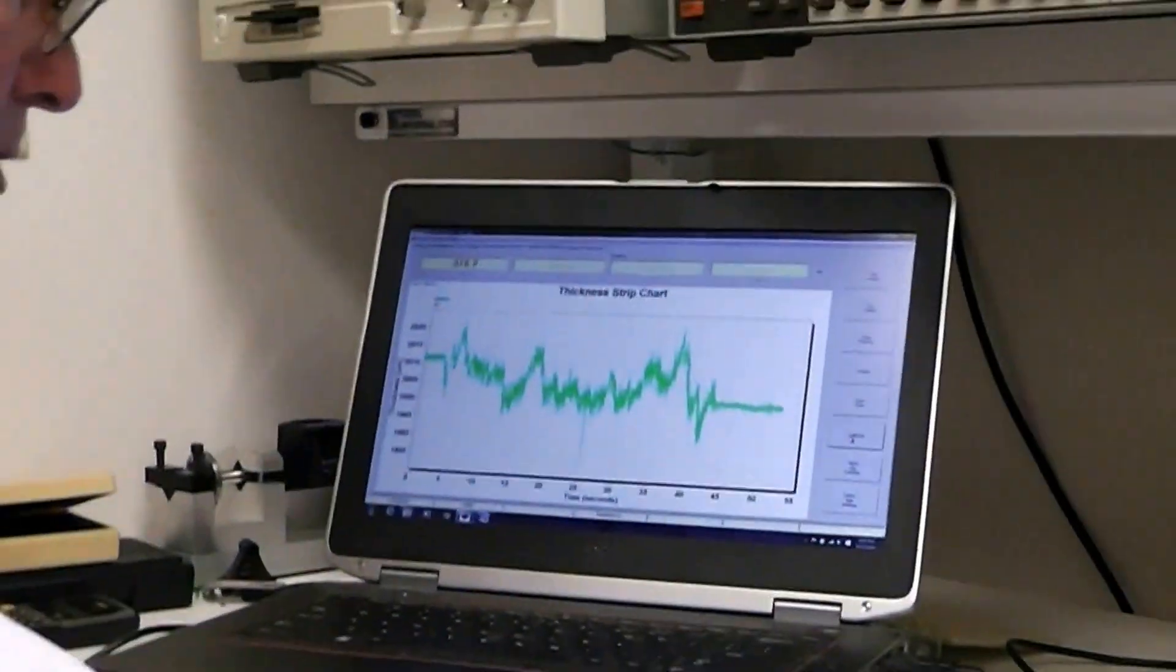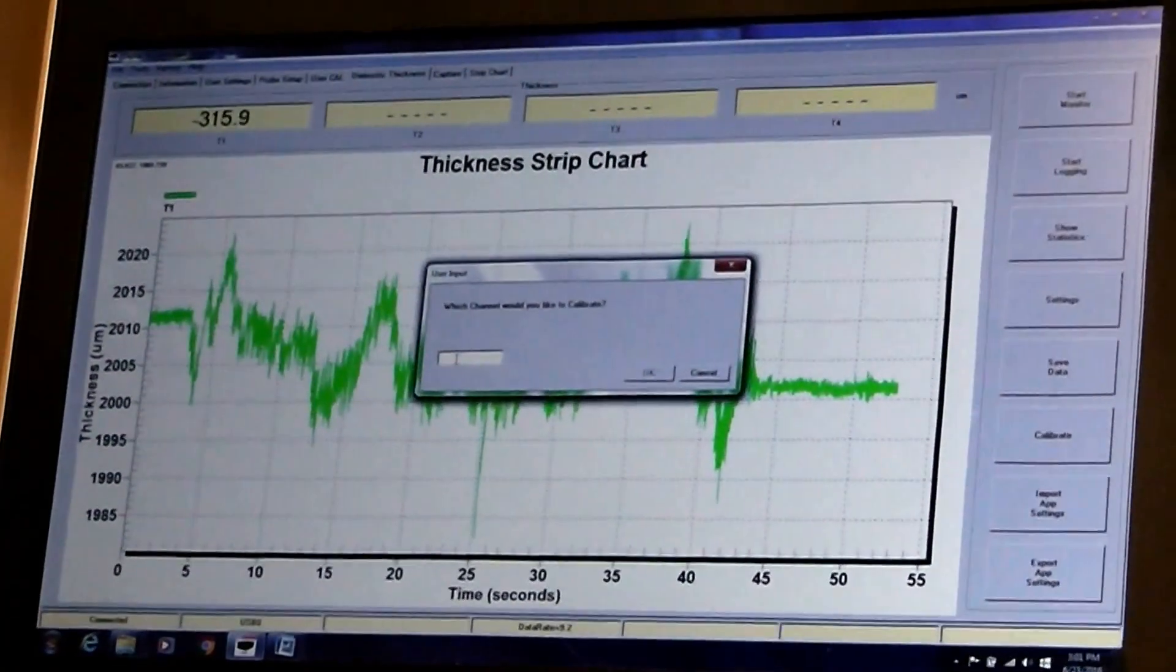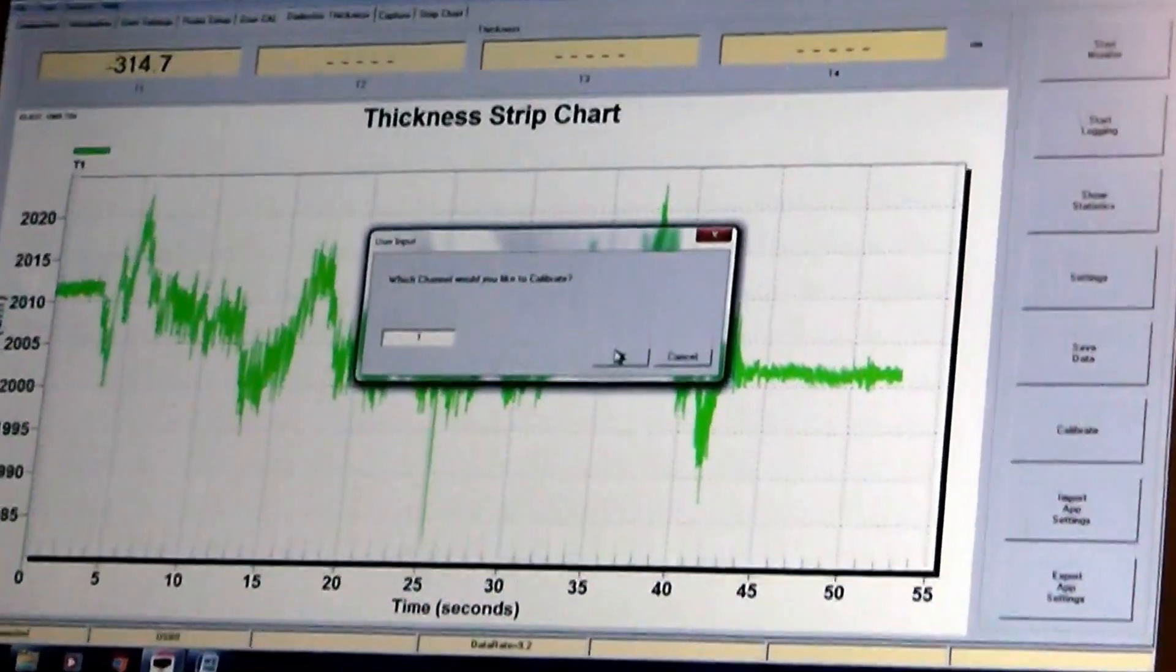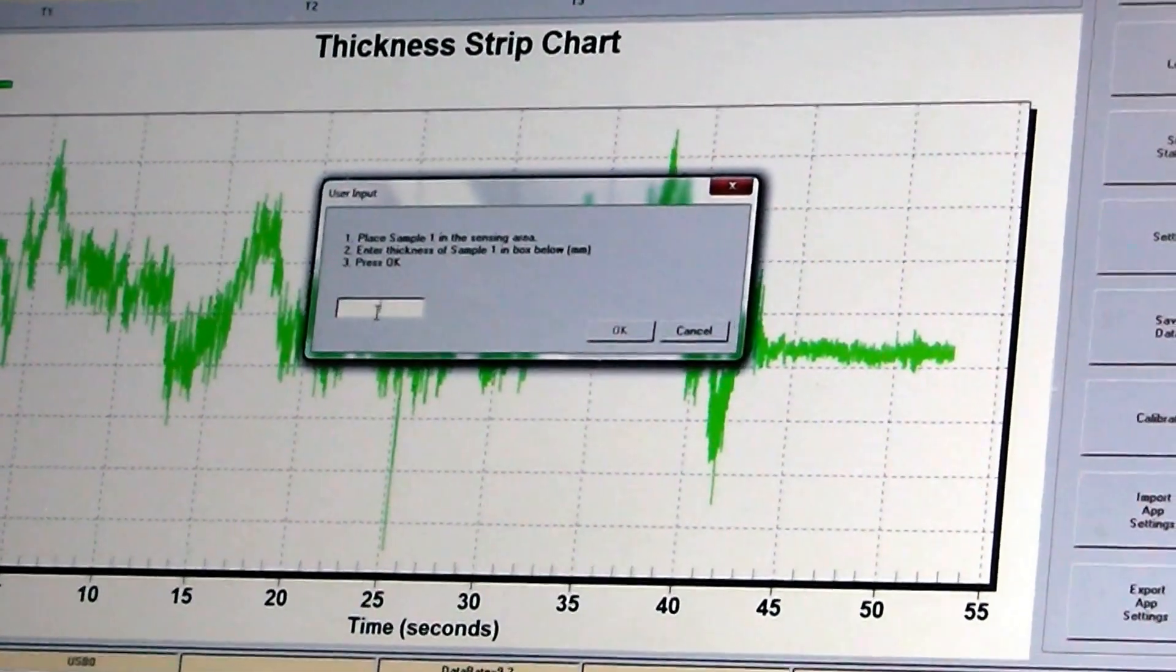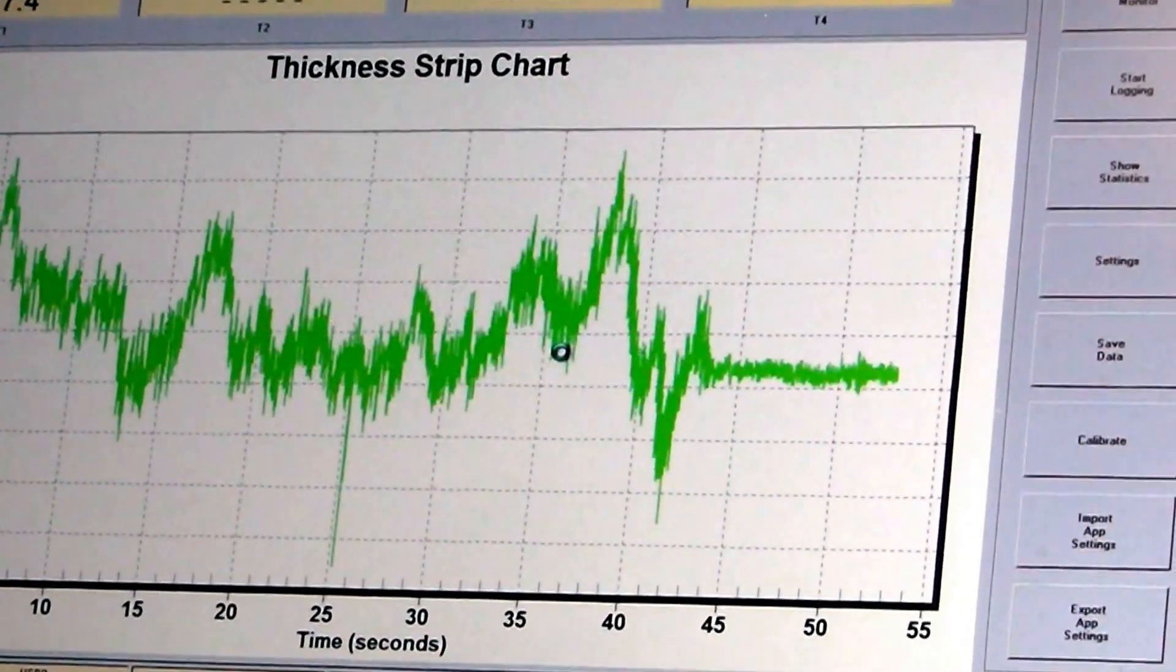We're going to start the calibration procedure by clicking the calibrate button, and I'm calibrating channel 1. We only have one channel being used right now, so I enter 1 in there. The next thing I'm going to put in is 0 because we have 0 thickness in the gap right now. I click OK.